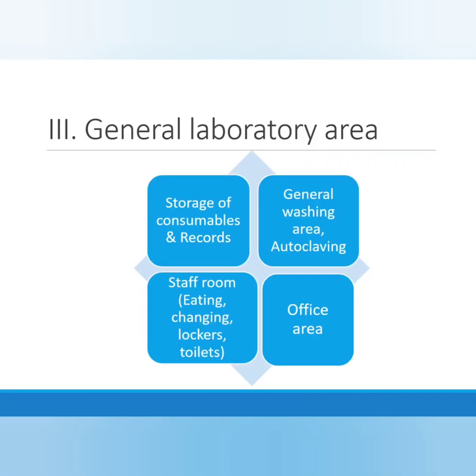The general laboratory area. There is no active processing and testing of specimens happening in the general laboratory area. However, they are necessary for the proper functioning of a wholesome laboratory.